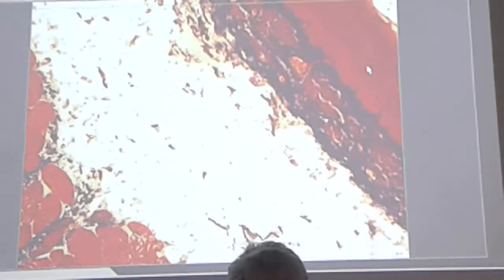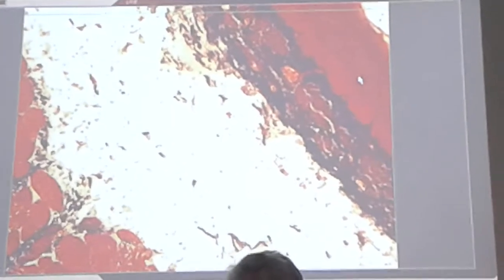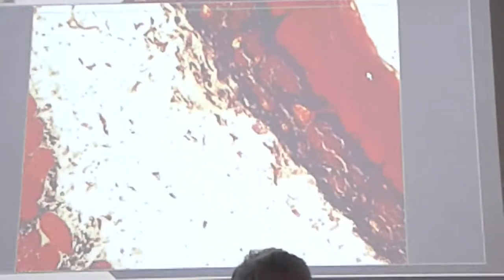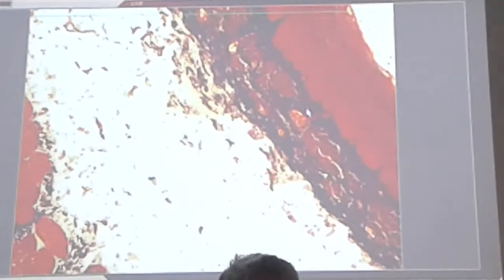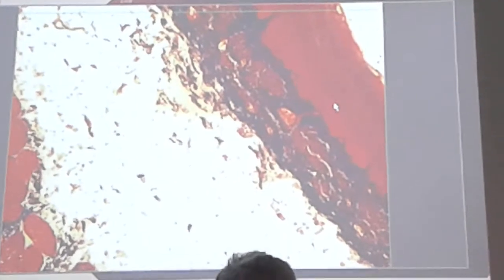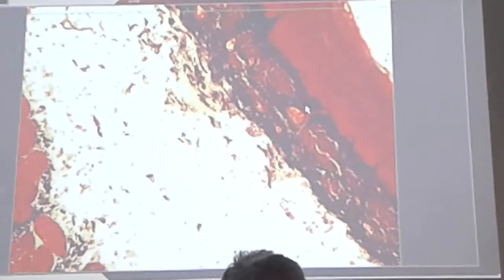Here the lamina propria includes more connective tissue, and since our section is stained with Mallory azan, as you see, the connective tissue fibers are stained in blue color, but our nuclei are stained in red color. So you can easily understand that this section is stained with Mallory azan staining.